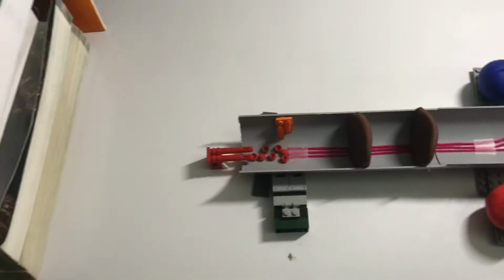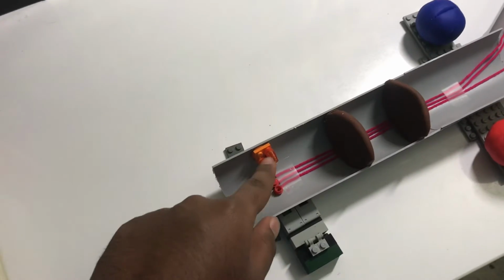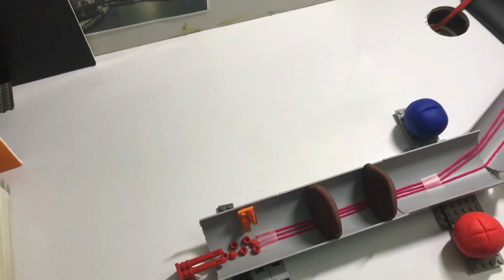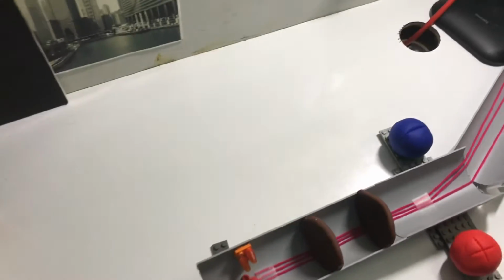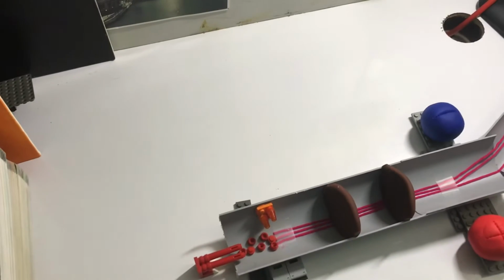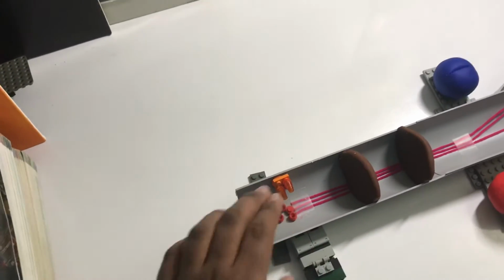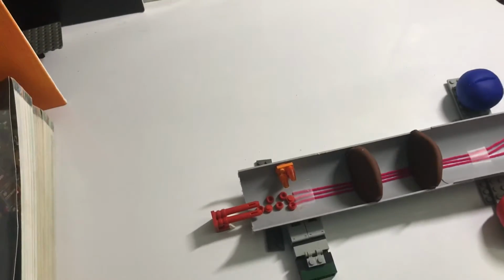The first stage is a pretty simple one. It's just vaporization. This is where the heating filament, represented in orange, heats up and vaporizes the sample element into the gaseous state. Therefore, it has the highest kinetic energy, and that's basically it. The second stage is ionization. This is where an electron beam source bombards the gaseous state sample element and creates positive ions in the process.